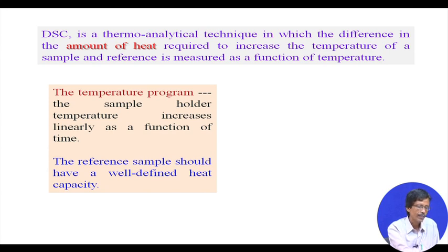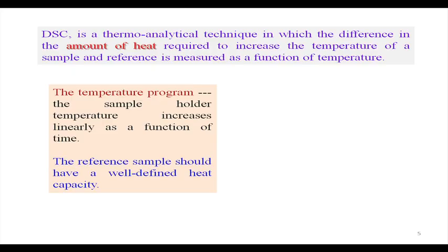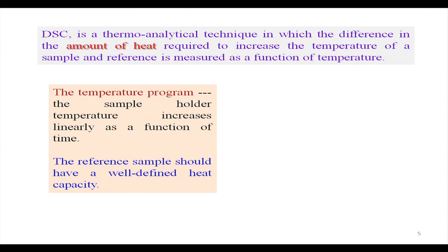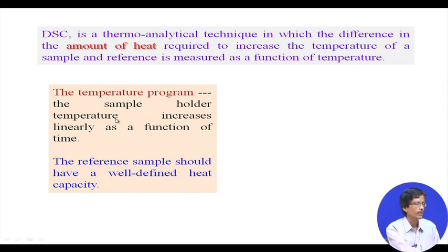So, if you have a differential scanning calorimeter in hand, within which you put both R and S, the reference material and the sample material, and if the differential scanning calorimeter is of isothermal type, and we have a corresponding resistive heater in your hand, and the thermocouples are also connected which can register a voltage, and you can have the automatic control loop, and that control loop goes through the Wheatstone bridge, and that gives rise to the corresponding recording of the system.